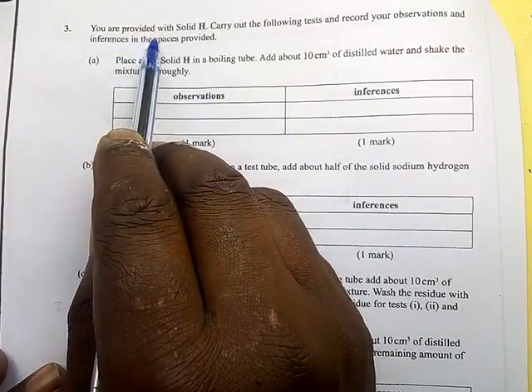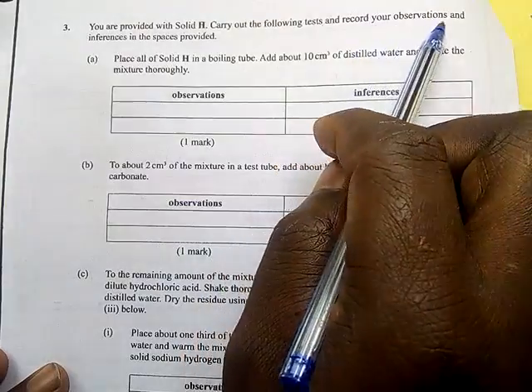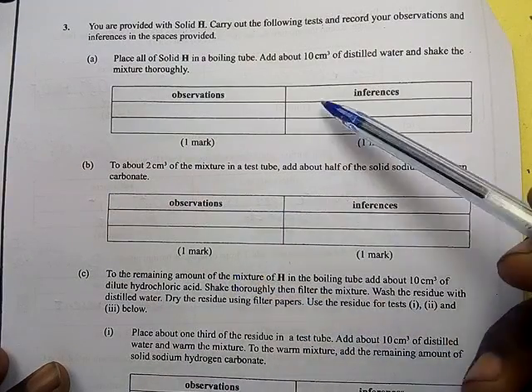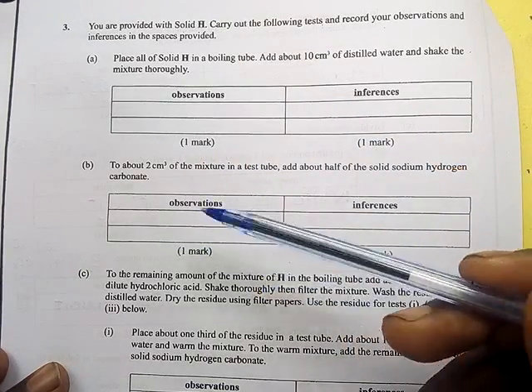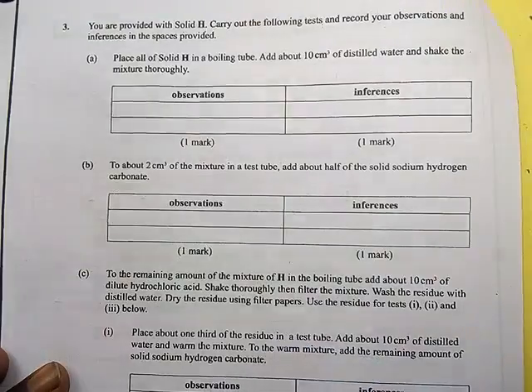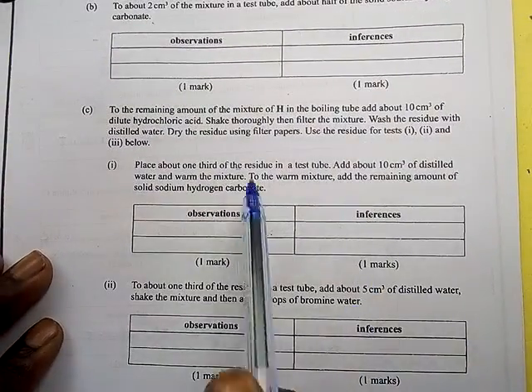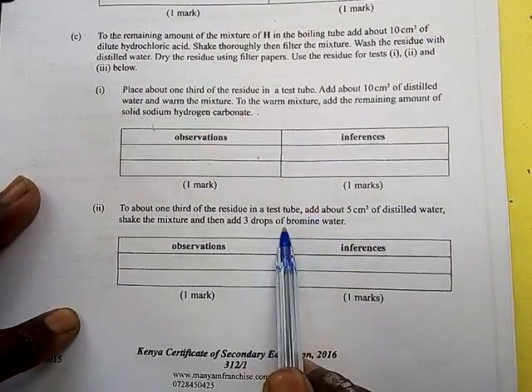Number 3, you are provided with solid H. Carry out the following tests and record your observations and inferences in the spaces provided. Like I've also advised, you need to know whether this solid is an organic compound or an inorganic compound. How do you know that? You first have to read through the reagents that are used. The first reagent here is sodium hydrogen carbonate. If you move down, we find sodium hydrogen carbonate repeated, and then we have bromine water.